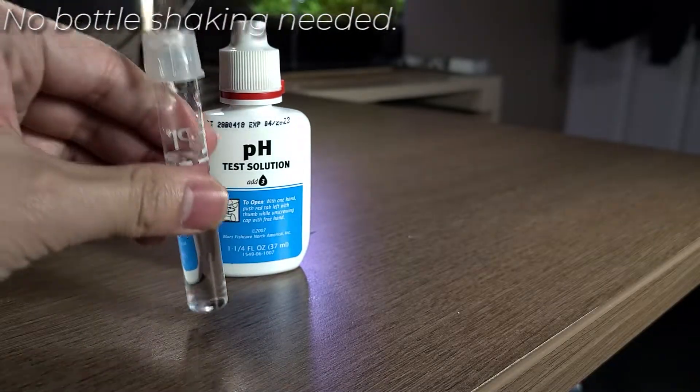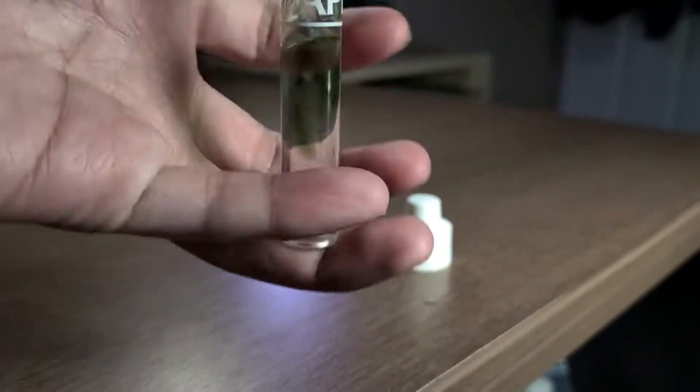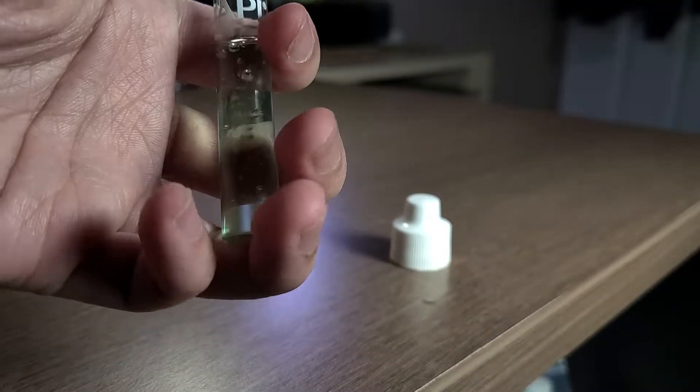For pH, there's no need to shake the bottle. Just add three drops, and once that's done, just give it a little shake and the results will be instantaneous.